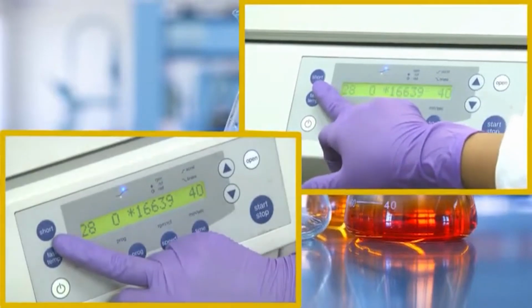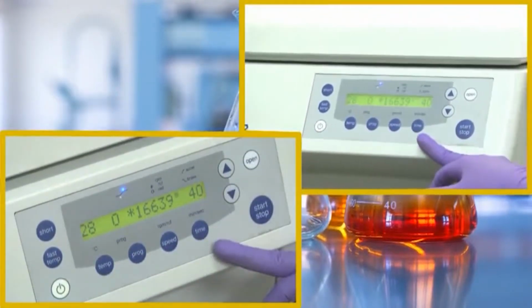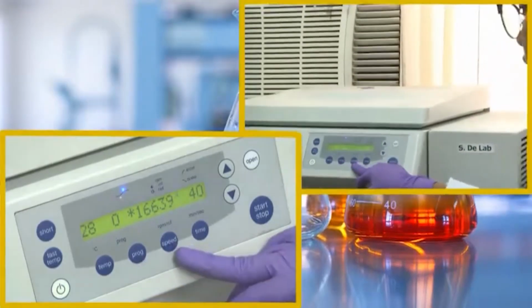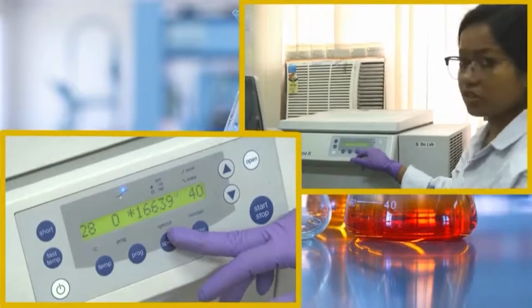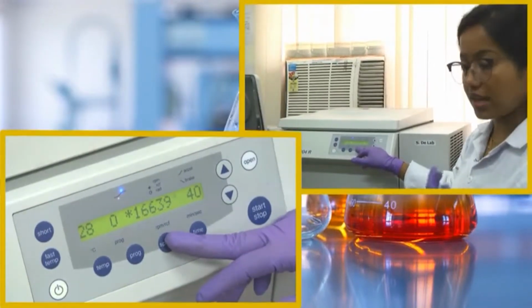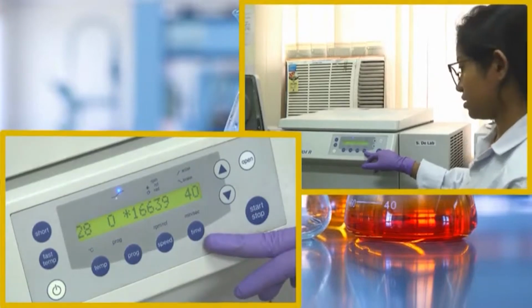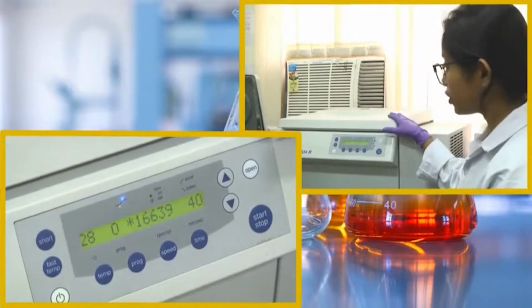There is also a short spin, if you want to spin down something, you can use that, and there are multiple programs you can set. The temperature you can monitor, regulate, and you can set a particular program for multiple use. The speed can be in RPM, the revolutions per minute, or the RCF, the G value. The G value is important because that is the actual force that will be generated by the RPM value. And then the time. It can go up to minutes and seconds. It can go for 1 hour or maybe even more. So, the centrifugation is running now.